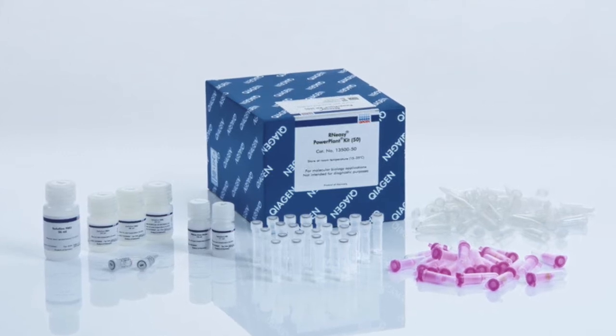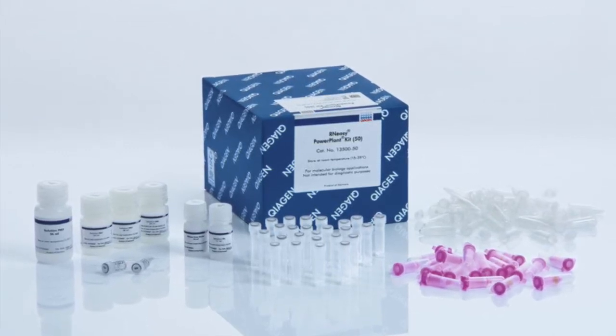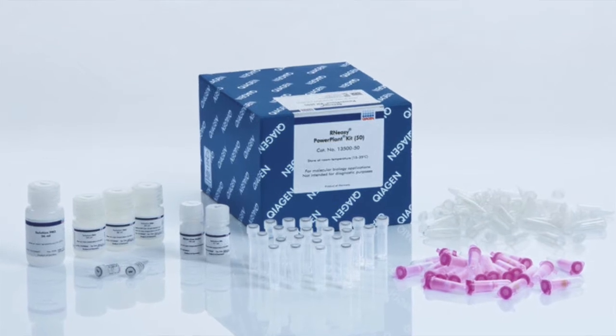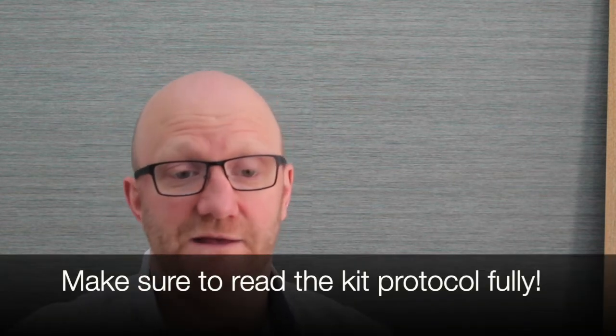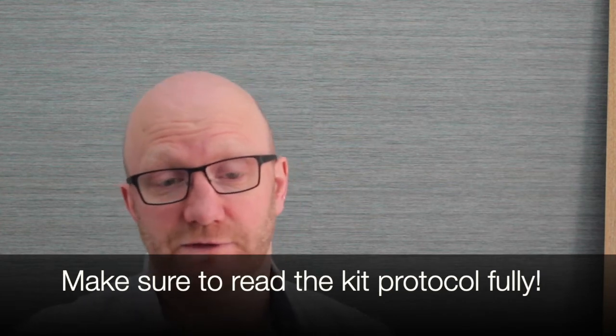And you then follow the protocol which comes with a kit, which usually involves using a centrifuge or vacuum to draw your sample through a column, and that column has a membrane on the bottom that binds RNA. You then wash through the column with a number of different solutions that clear any protein, DNA, or other contaminants, and then finally you elute the RNA from the column using a buffer that will dissolve RNA. Each kit will have protocols for different sizes or types of tissue or numbers of cells. So you always need to check that you are working within the range that's acceptable for the kit.